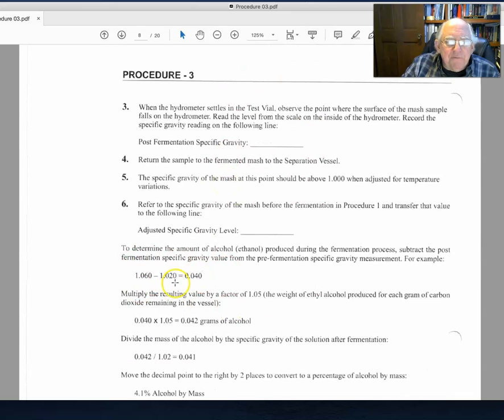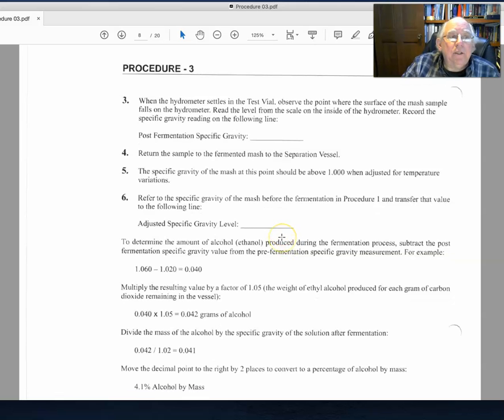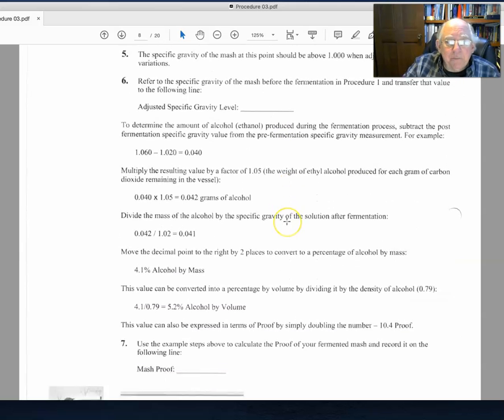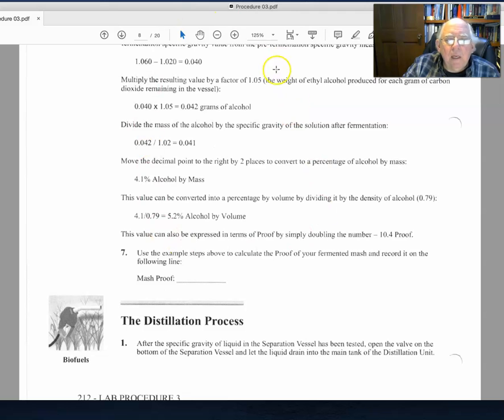Then we could use the difference in the specific gravity to determine the percentage or the percent by alcohol that has been obtained during the fermentation process. If we had our original data and then our data at this particular point, we could then figure out the proof associated with what we currently have.